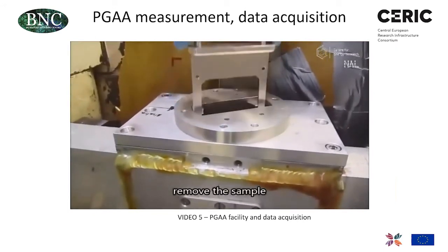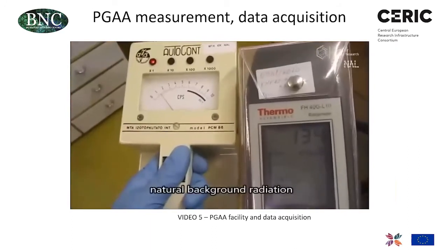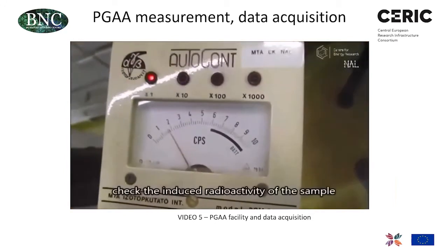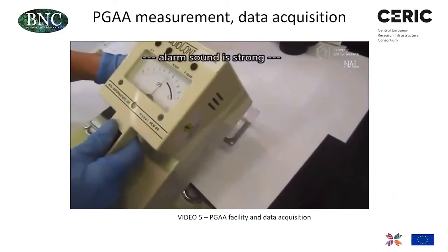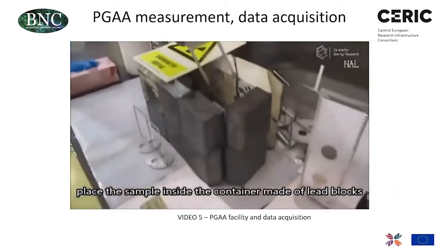Once the measurement is over, you can remove the sample from the sample chamber, and we have the devices to check the residual radioactivity of the sample. And immediately after removal from the neutron beam, this can be significant.